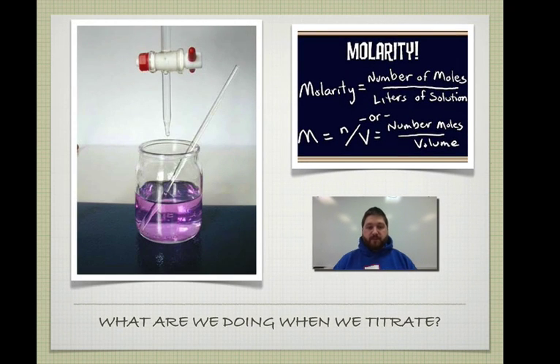Alright, so what are you looking at when you're doing your titration with the molarity? The idea behind titration is that you've got some unknown molarity substance below and a known molarity up in your burette. So if you know what the molarity is here and you're dripping it into this and you reach an equivalence point, you can use some of the stoichiometry stuff that we've used, the molarity of the original solution, in order to calculate what this would be down here. This is what we did in the post lab, and we'll be working on some calculations in class about this as well.